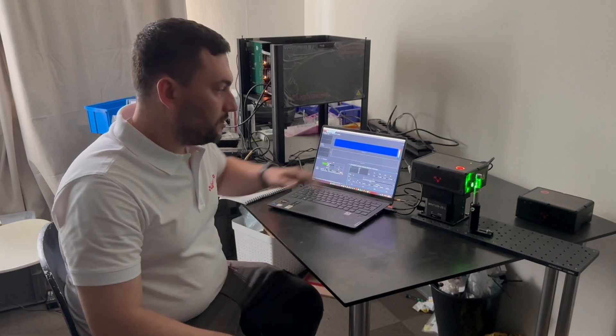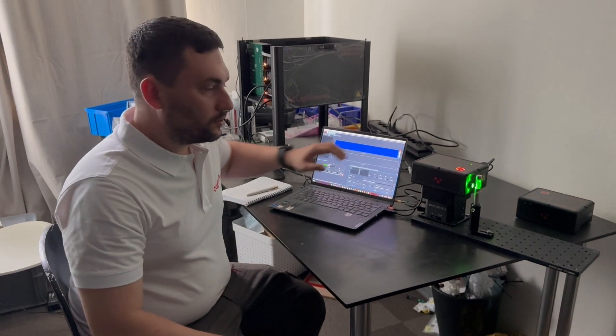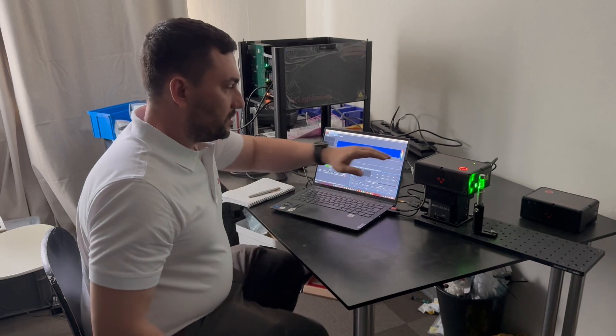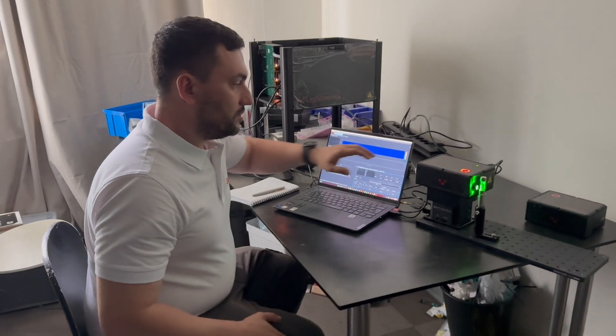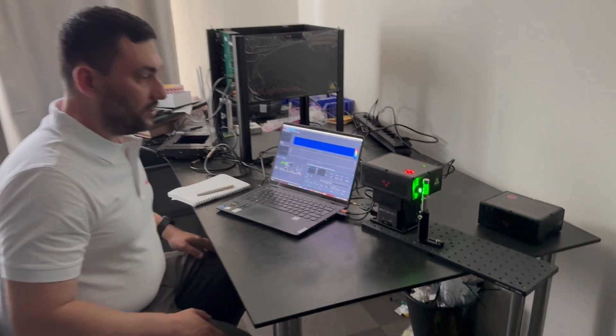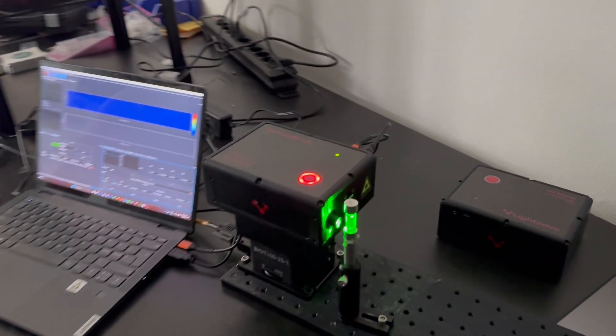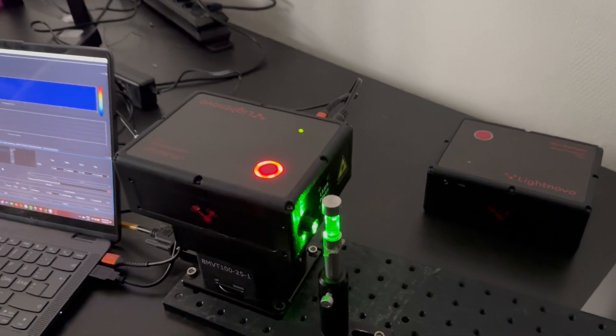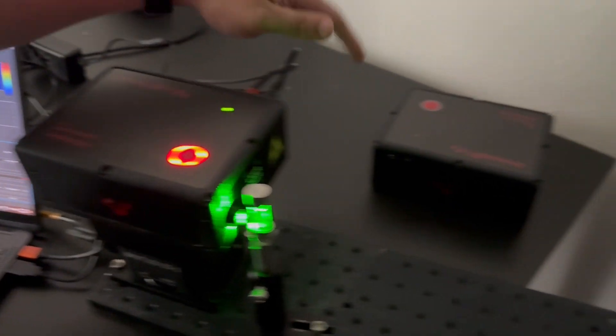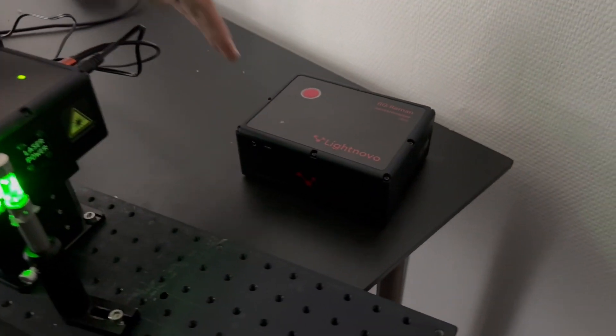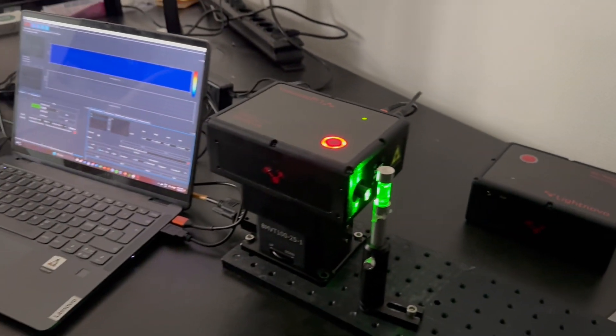Hello, I'm Yaroslav from LightNovo and I'll present our new line-scan system based on our RG spectrometer. This current system uses an RG 532nm spectrometer but we also have an option with 785nm spectrometer as well as other wavelengths.